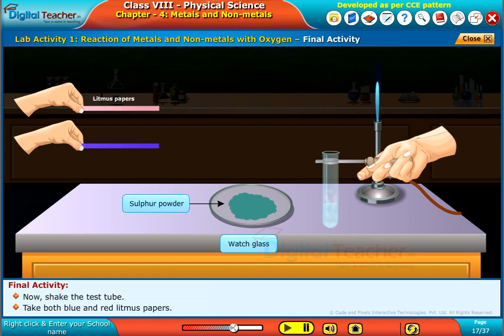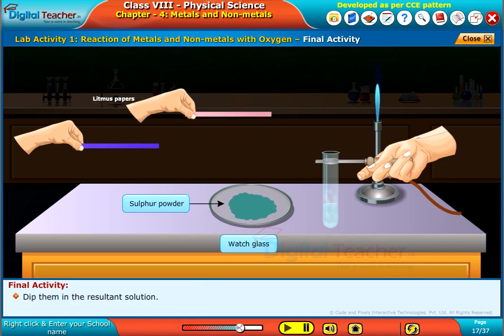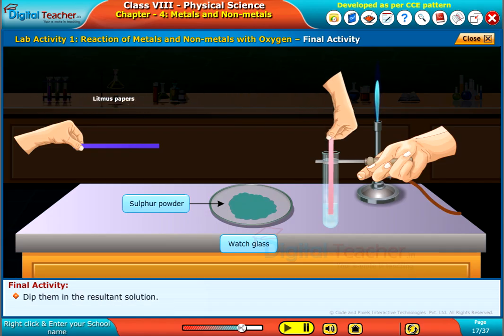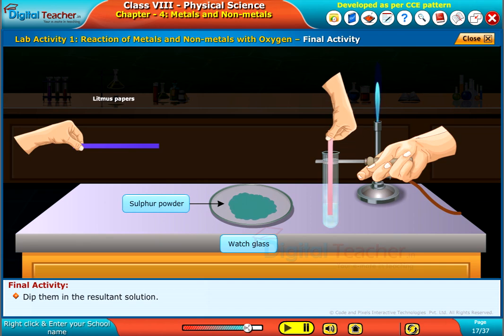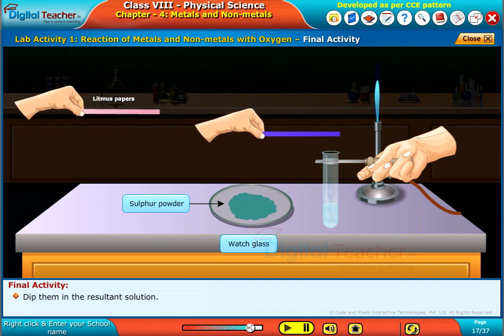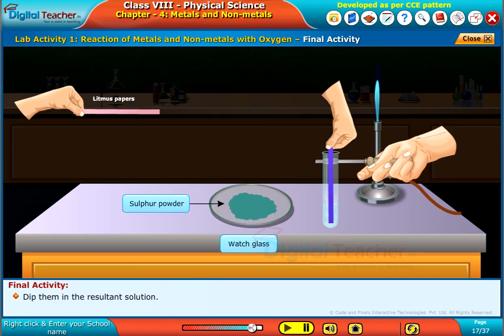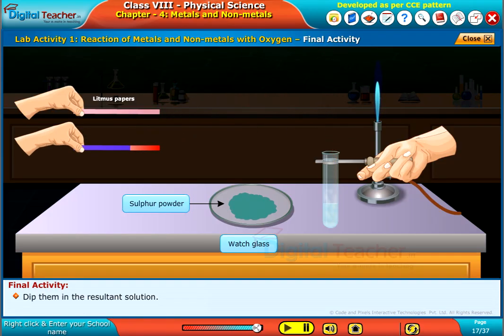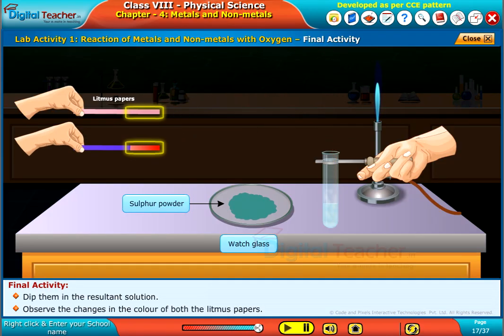Take both blue and red litmus papers. Dip them in the resultant solution and observe the changes in the colour of both the litmus papers.